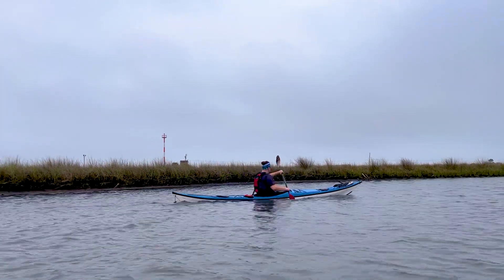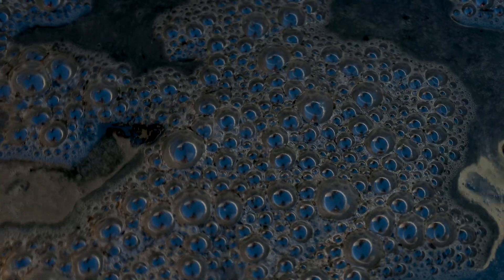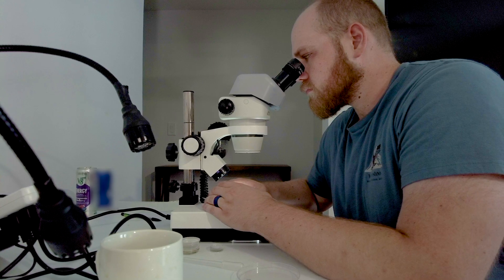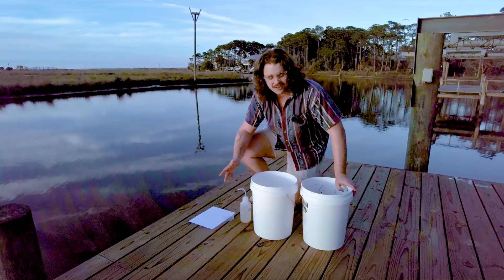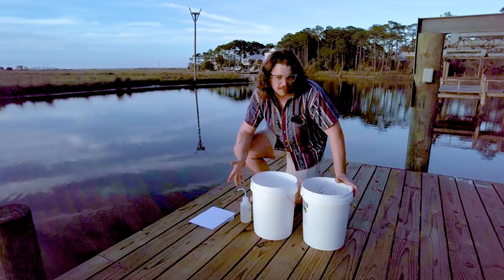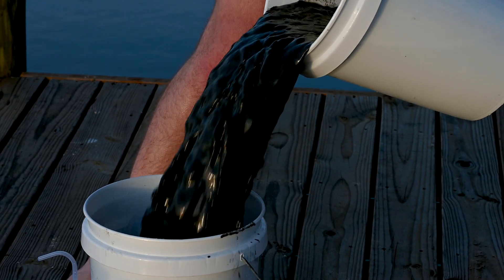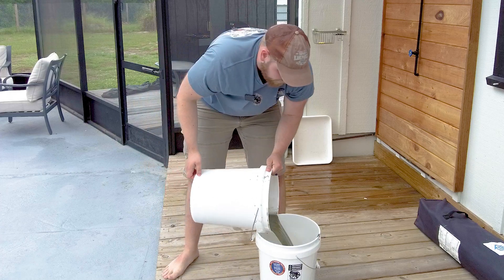Today we're embarking on an exciting quest to uncover one of the ocean's tiniest secrets — the elusive mud dragon, also known as Kinorhyncha. These tiny creatures are notoriously hard to find, but we'll guide you step by step through the bubble and blot method, a simple yet effective way to find these animals. It may take us a couple of tries, but stay with us till the end to see if we can find one of these elusive dragons.